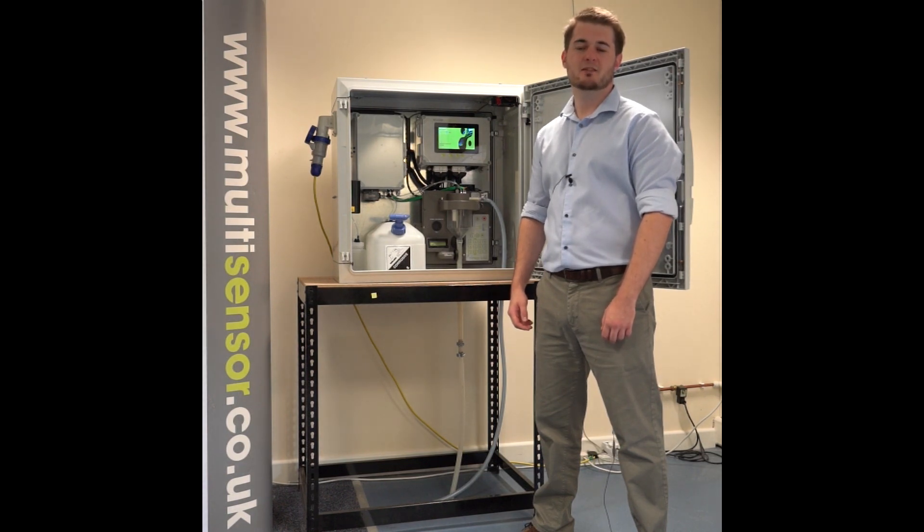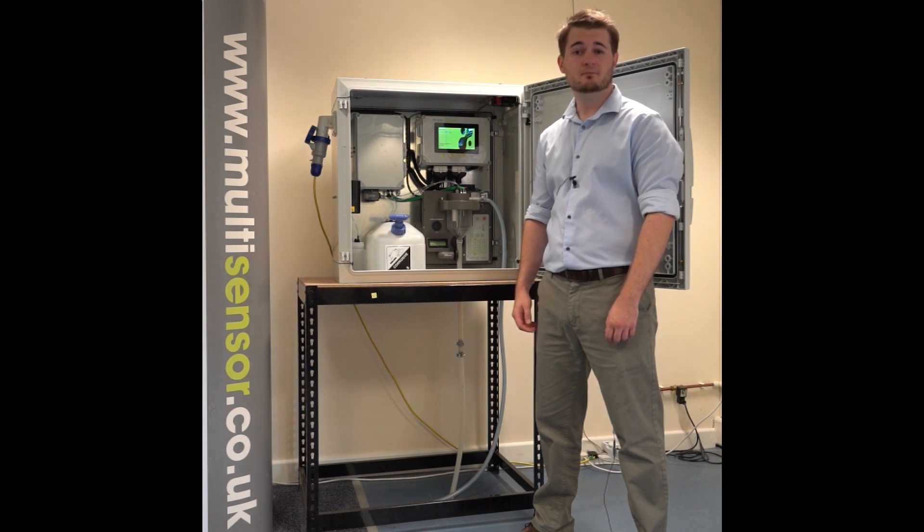Hello, my name is Andrew McInnes and I'm the Senior Instrumentation Engineer here at Multisensor Systems. In this short video, I'm going to walk you through the main applications, features and benefits of the MS-3500 Ammonium Monitor for Wastewater.